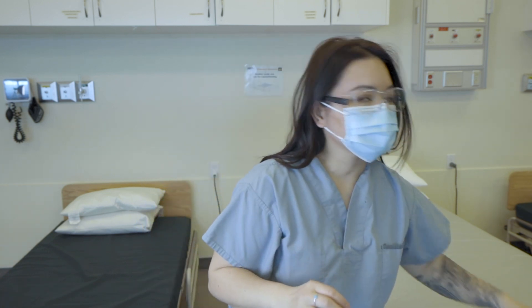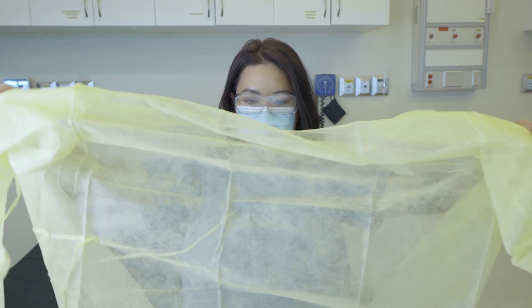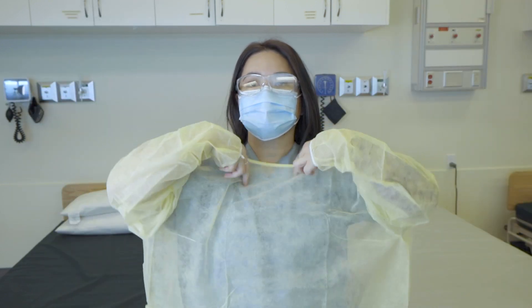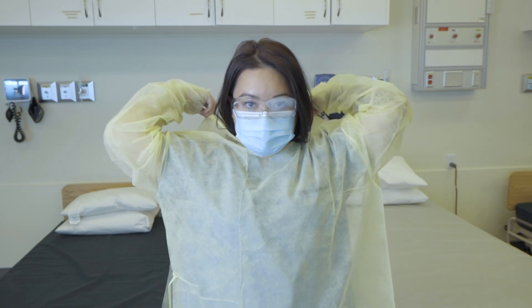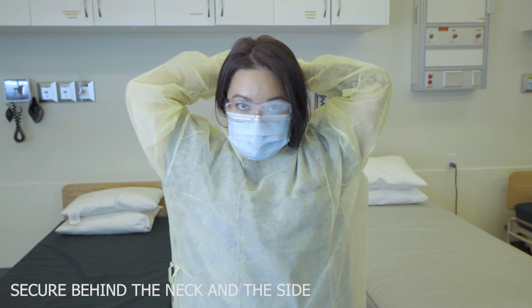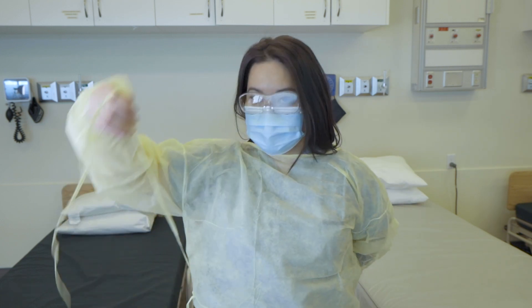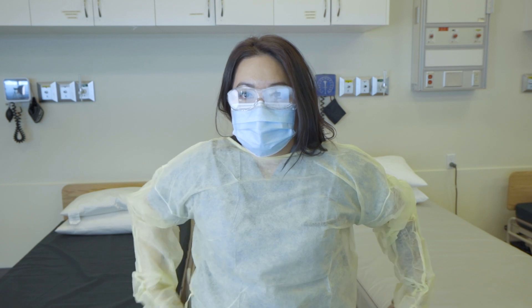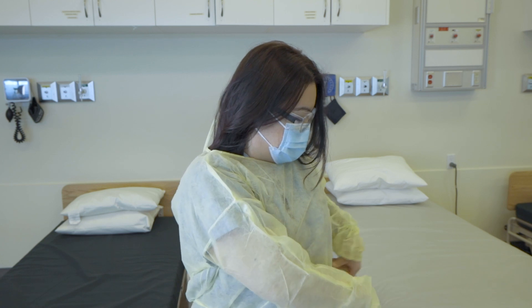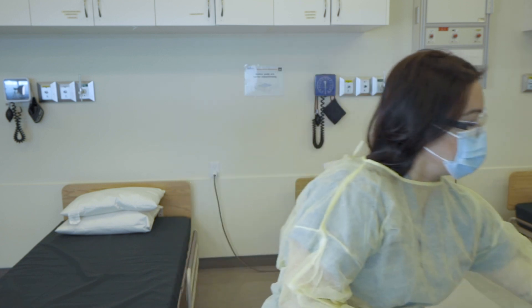Followed by the isolation gown. We want this tied securely behind our neck and then around our waist towards the lateral side on either side of the body. And then if you do have extra fabric, you kind of just want to cover your back if possible, just in case you touch any surfaces that you know are contaminated.